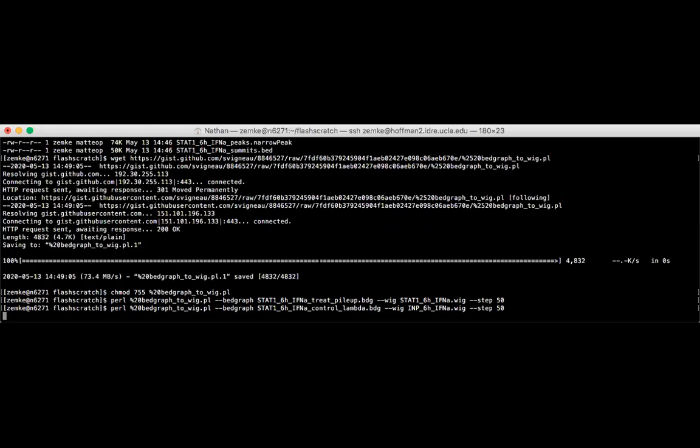So after I make this, and then I make the bed graph, and then I make the bed file, then I will transfer those files to my computer's hard drive. I will download the IGB Genome Browser and load those files into the Genome Browser, and then while that's happening, I will run the other MACS2 peak calling program.